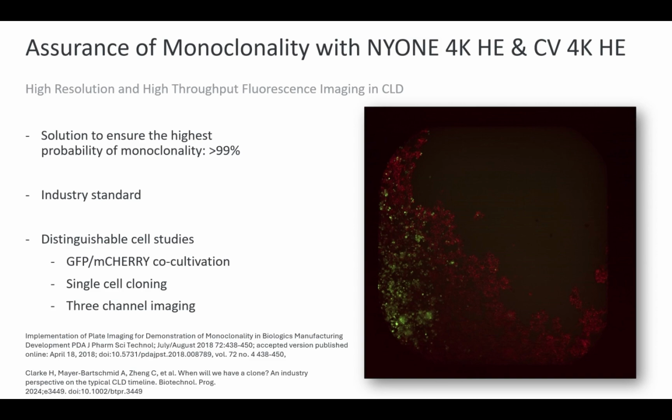And this enables looking into the process efficiency and process accuracy of generating meaningful data for the proof of monoclonality. A study like this not only enables people to generate data on ghost well probabilities, but also on false clonal well probabilities, where there basically is a ghost well above a clonal well, so to speak.